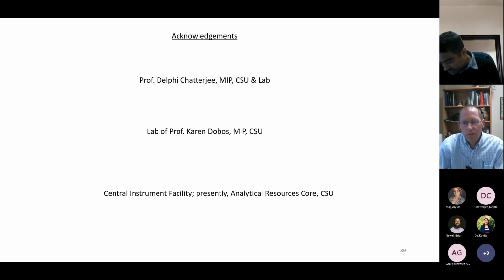Yeah, there are certainly some efforts using both of those techniques, but there are others that don't actually utilize chemistry at all. It's more of a pure machine learning approach. The limitation with those is that sometimes they benefit from some knowledge, and an additional one is that you need a really, really big number of spectra to train those models, and there are not enough of them out there. So the question is, are there even enough purified structures out there by which to generate more MS/MS spectra? I'm not aware of any, but I wanted to see if you were.